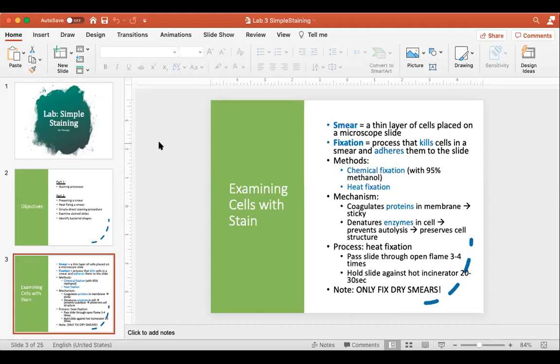So let's spend a couple minutes first talking about stains and introducing some vocabulary about stains. We use a lot of stains in the microbiology lab. The only other lab that uses so many staining chemicals is the pathology lab. We have so many stains because each stain is designed for different types of microbes. Each stain is designed to highlight different structures in a cell. Some stains are designed for very particular types of microbes, and some you can stain virtually any microbe with.